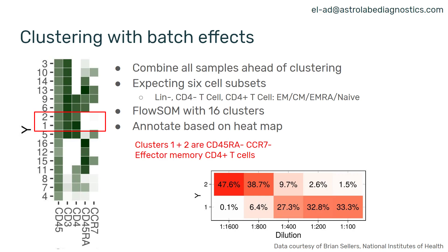This is not a FlowSOM issue — you would see this with FlowSOM, with SPADE, with Phenograph, with TSNE, with UMAP. Any method you use for analyzing this data is susceptible to batch effects.